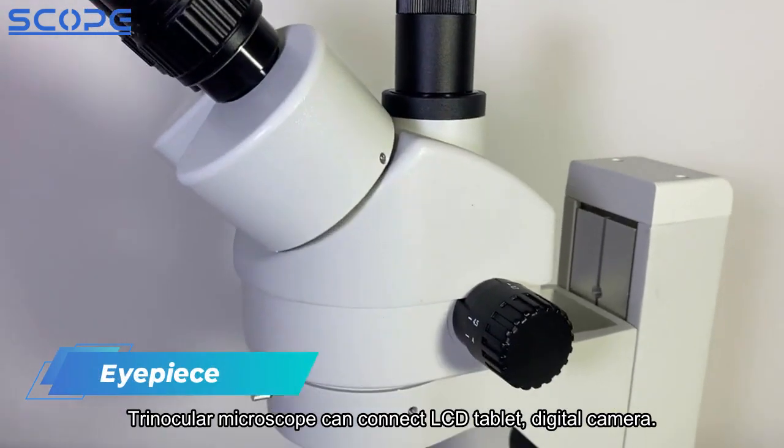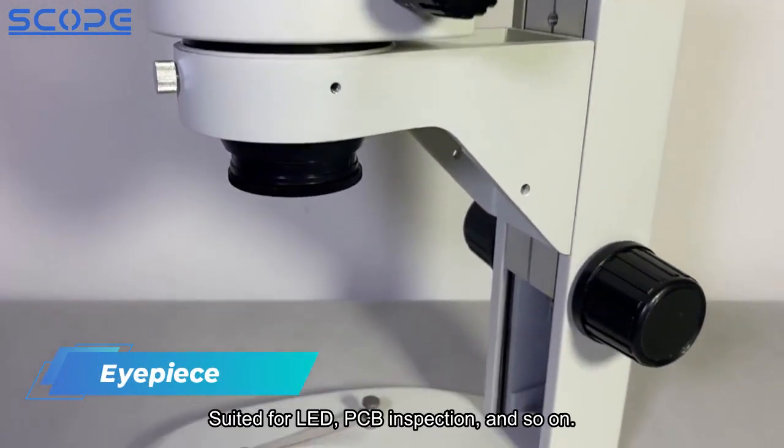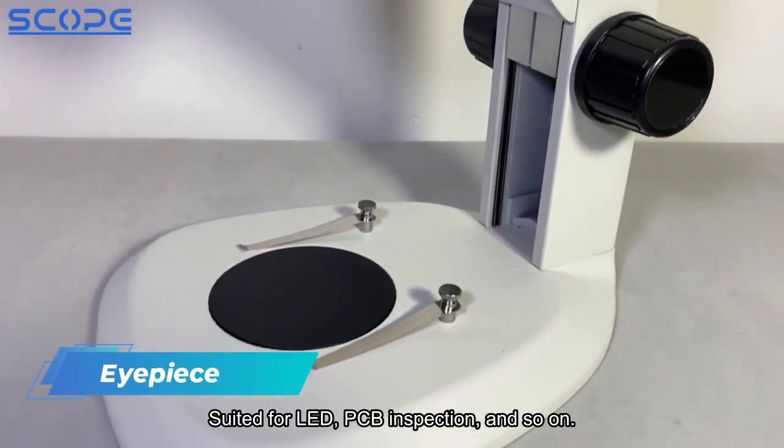The trinocular microscope can connect to an LCD tablet or digital camera, and is suited for LED and PCB inspection, and so on.